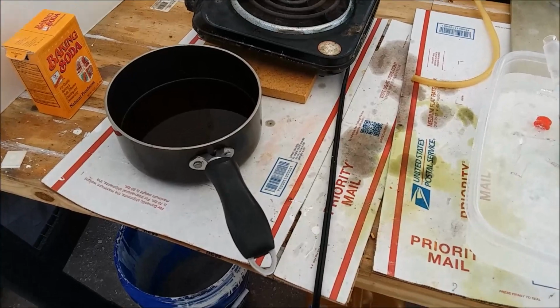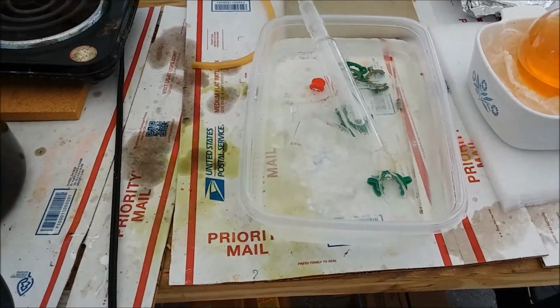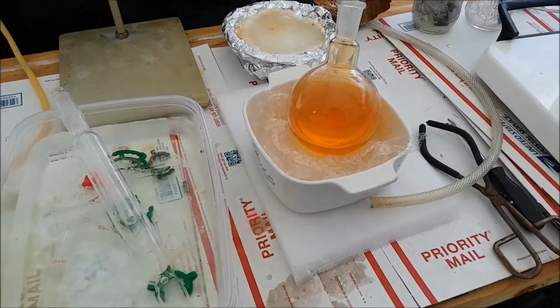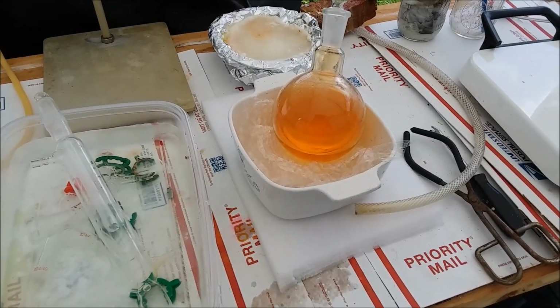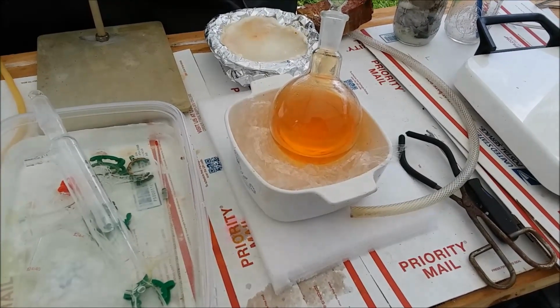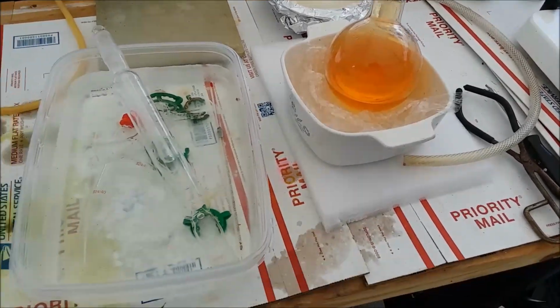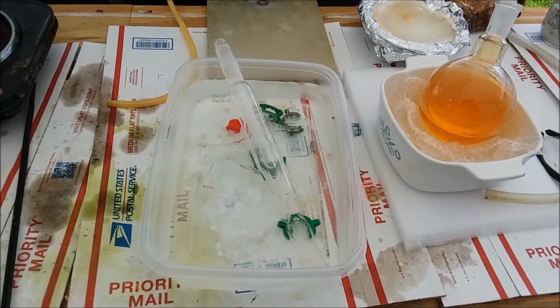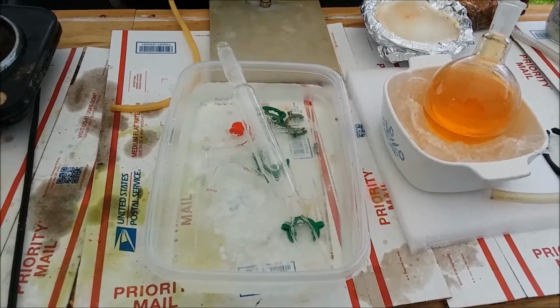I got a pot full of hot oil. I've got to clean all this glassware. I've got to dump that out into a beaker and measure my yield and figure out how much water I'm going to have to add to dilute it to the azeotrope, 68% azeotrope. But first, I think I'm going to have lunch. I'm hungry. Getting late in the day.